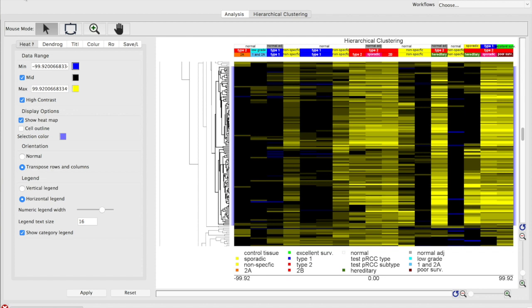This entry is part six in a series of instructional videos detailing a meta-analysis on eight different human gene expression studies looking at papillary renal cell carcinoma.